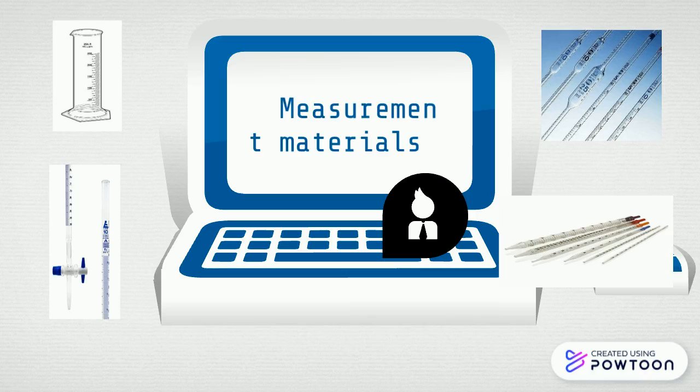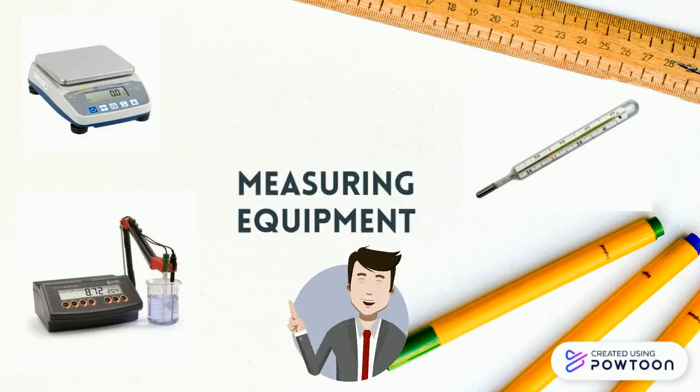It could be from one, two, or five milliliters. In this measuring kit we also see a balance, pH meter, and thermometer.